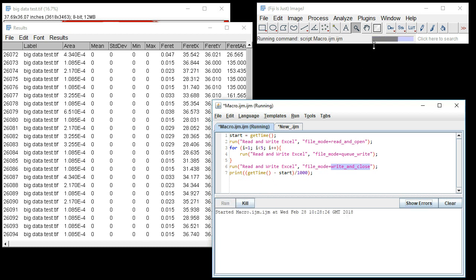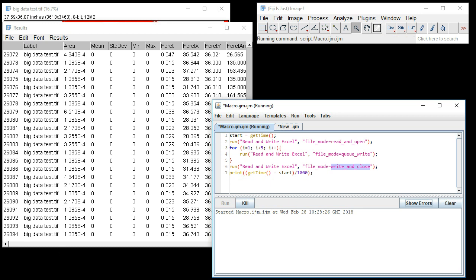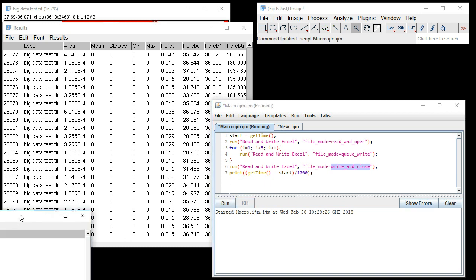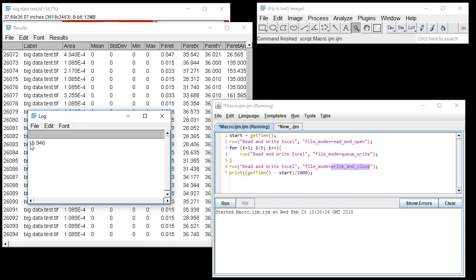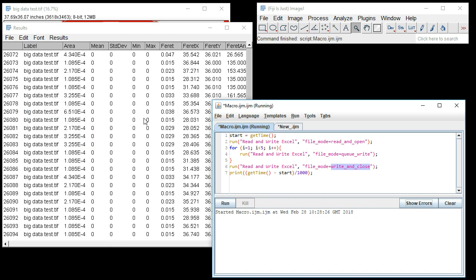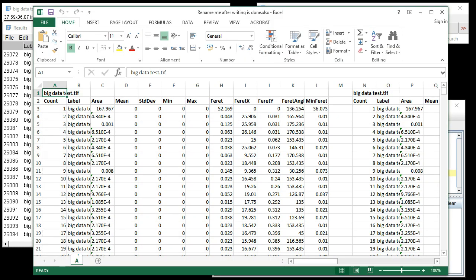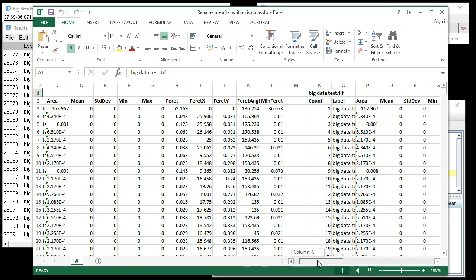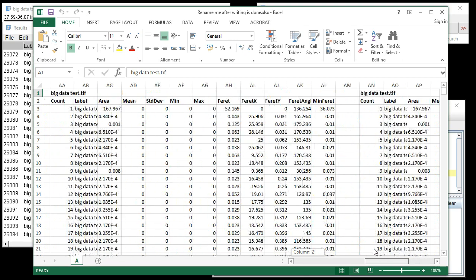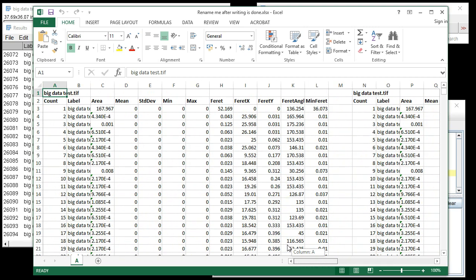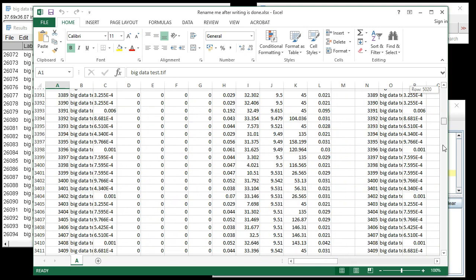If I run this, you can see each export happens individually and is tracked by the progress bar. In our desktop file, and the whole process took 16 seconds. That's just the macro I've got to output that, so that won't be in the plugin by default. In our desktop file, we can see that all data has been added in the same file.